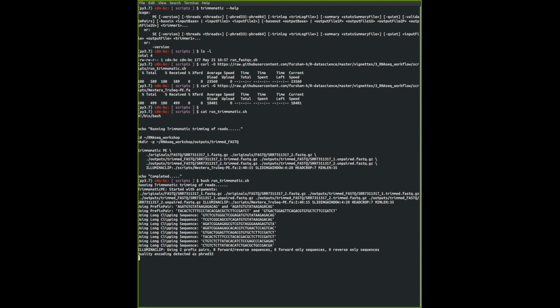This is single cell RNA-seq data from just one experiment, so it's a very small data set. Within a minute, it should be done on any platform, and we didn't provide any multi-threading option, so this should be rather fast. Let me see if I can paste this to the Etherpad as well while we wait.